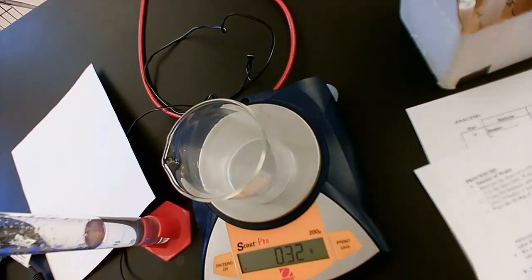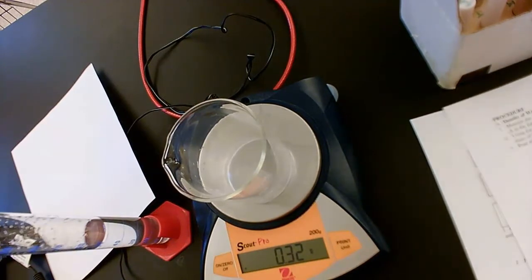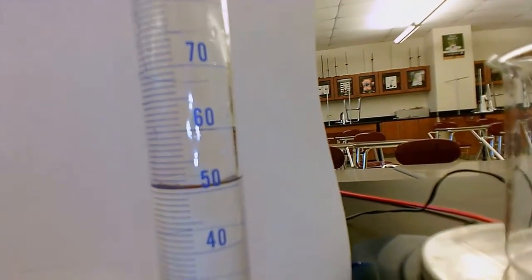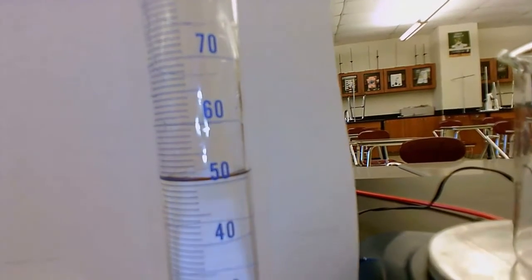When you are recording volumes, you should make sure your volumes are always to 1 decimal place. Oops, it's upside down. Well, I think this is better than all the lag time, so that's why I'm doing it this way. So it's very easy to see when I put paper up. This is your volume.